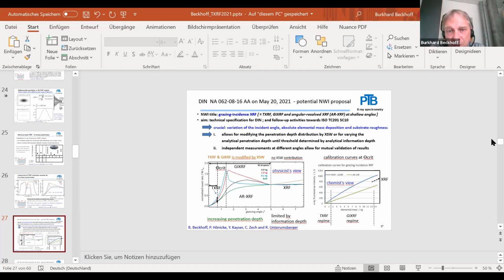We're doing this twice. So we were proposing this as an open round robin activity, as a German round robin with international participation. And then we do a round robin activity with a higher international participation. So you're more than welcome to join both of them. The first one was to find pitfalls of the samples. And then we were further reducing this also to have a reference document.